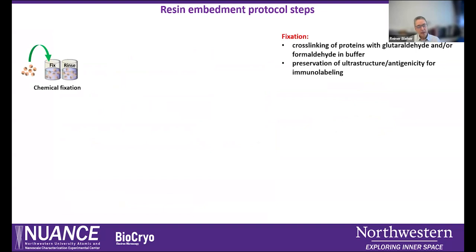So we first have chemical fixation. That means we cross-link the proteins in order to preserve the ultrastructure. We have different fixatives for that and different buffers depending on the purpose of the study. The fixative is rinsed out.